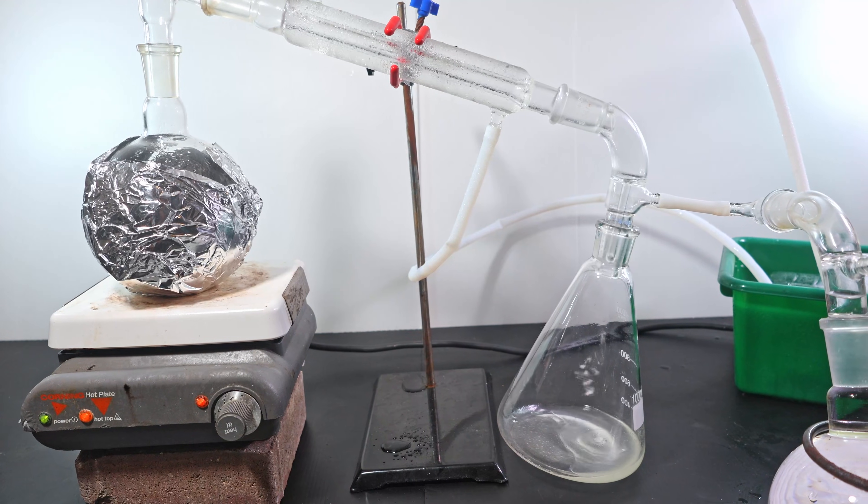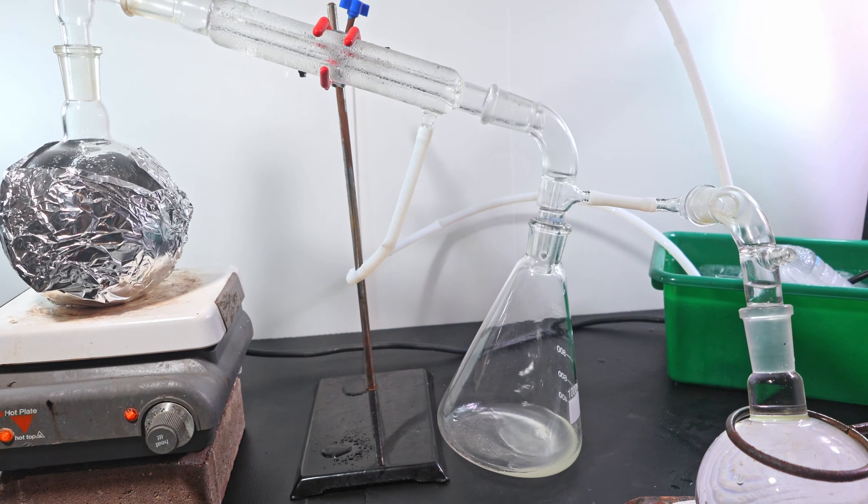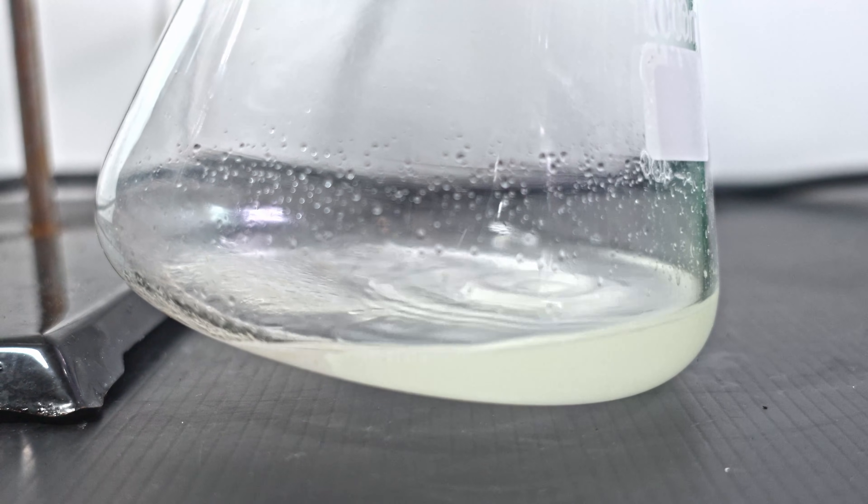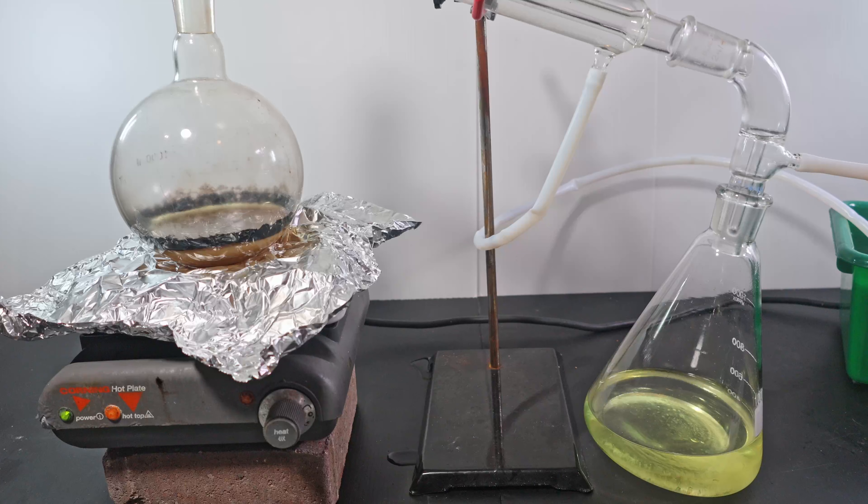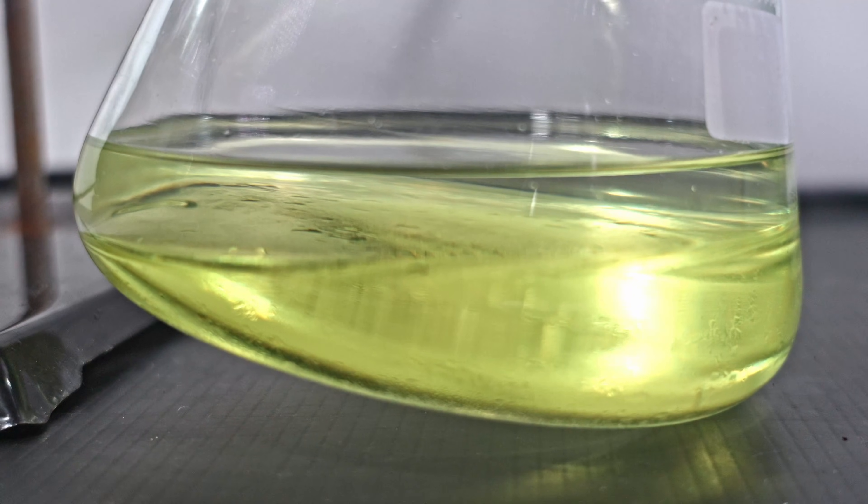I distill this under a water trap so lachrymatory vapors don't escape. One thing I noticed was how cloudy the distillation was. I may be getting allyl bromide first already. The reaction flask is completely black. When the distillation finishes, a ring of tar and a molten salt puddle are left. My distillate has taken on a light yellow color, probably due to some decomposed impurities.